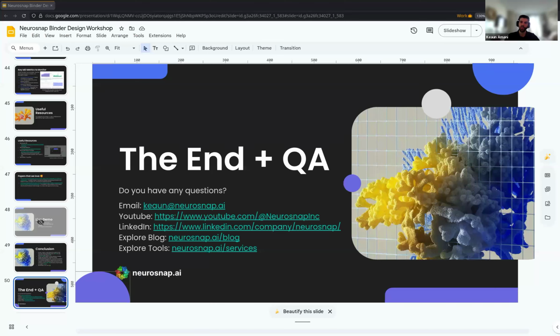Ideally, you should get around 25 or 30 different candidates afterwards, which should hopefully be improved in terms of affinity and some of the other properties the model optimizes for. Additionally, you can try using ligand MPNN based workflows. You can fix specific sites that you suspect might be useful to mutate, then generate a bunch of different variants, and screen those using some of the other methods we discussed previously and go from there.